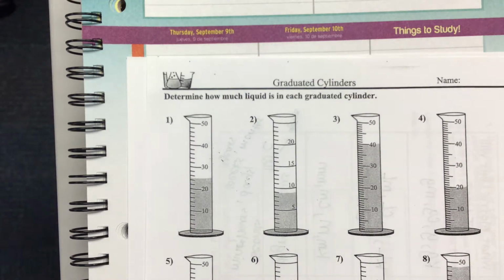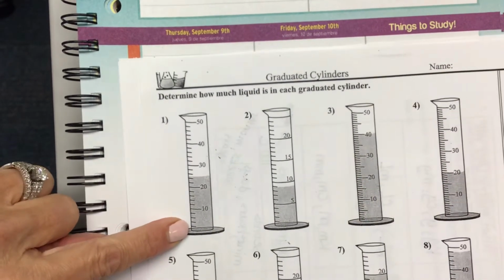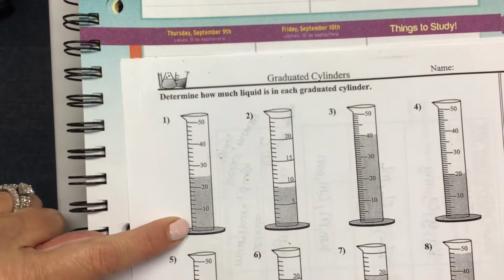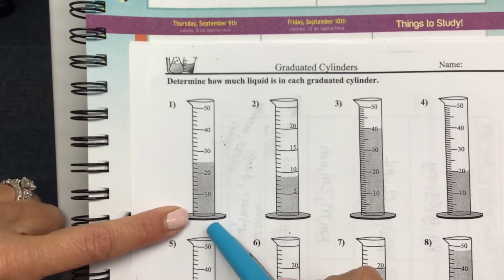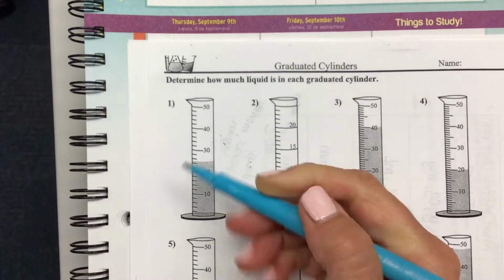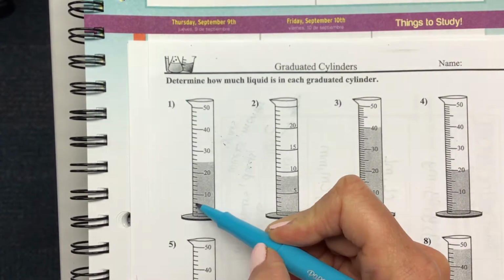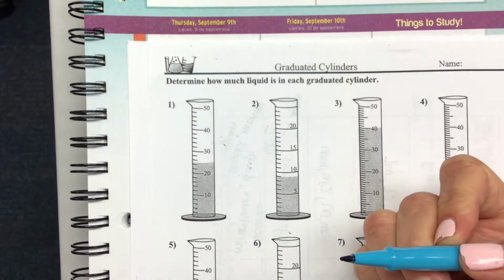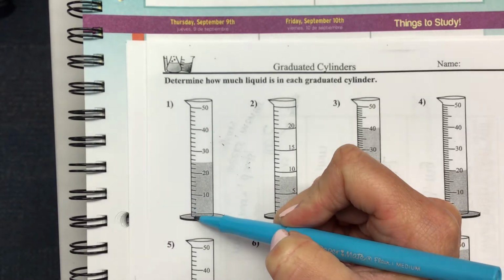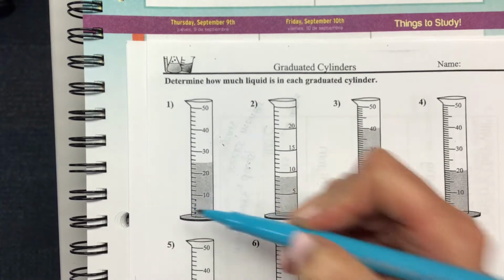Move up to the middle, please. On this one, if this is 0 down at the bottom, our scales always start with 0. Please be looking at the screen. I have a couple people not. The scale always starts with 0, and this is 10. What are each one of these little lines? How much is that? Are they 1s? Is it 0, 1, 2, 3, 4, 5? What is it? 2s. Everyone point to them and count with me. 0, 2, 4, 6, 8, 10.